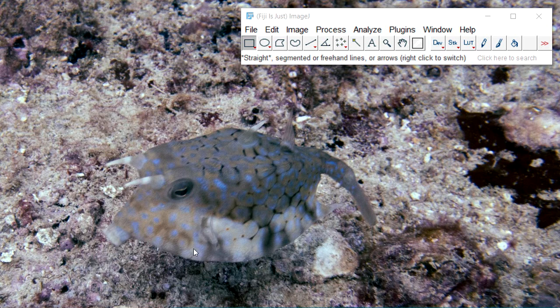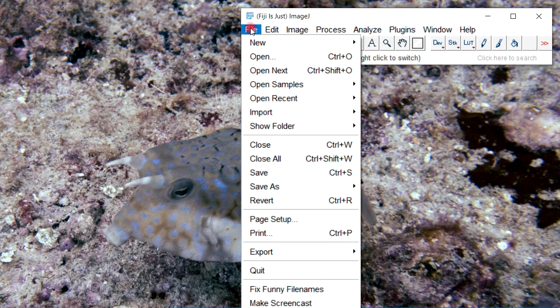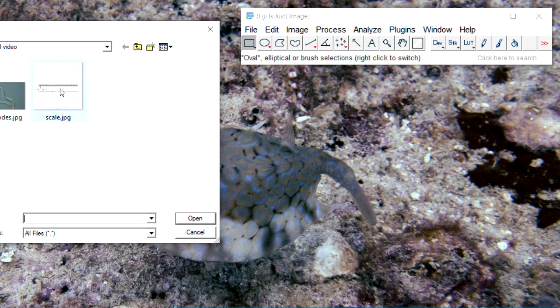Hello everybody. Today I'm going to show you how to do measurements in ImageJ. First, we're going to have to set the scale. We'll do this by opening a file that shows you the scale.